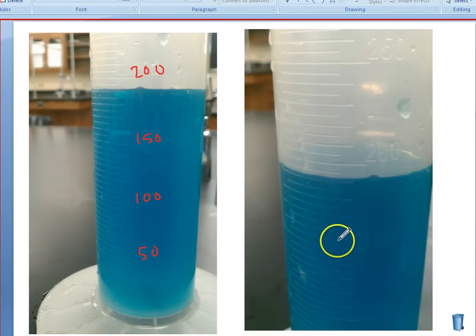150, 155, 160, 165, 170, 175, 180, 185, 190, 195, 200. So that is what that means. So I have 160, 170, 180, 190. A little bit over 190, but not quite to 195. So I'm going to say that that's maybe 192 milliliters. Again, this last digit is an estimated digit.